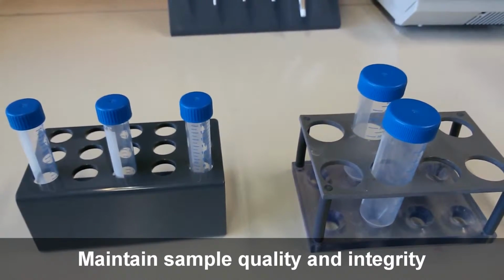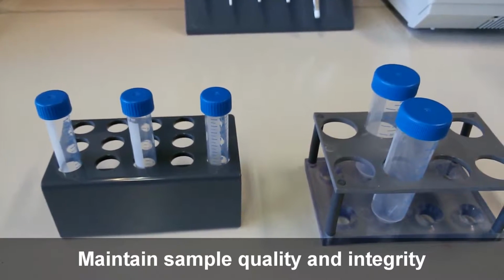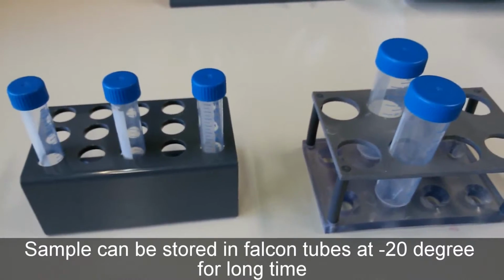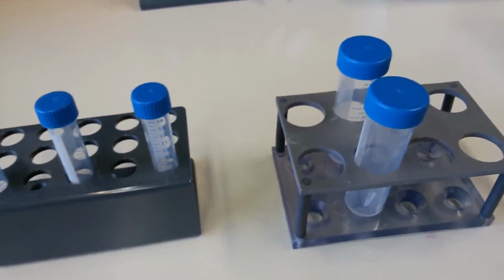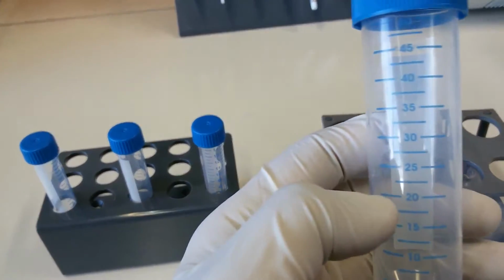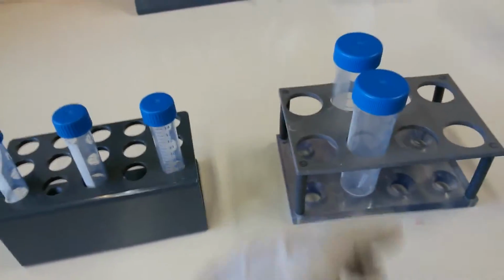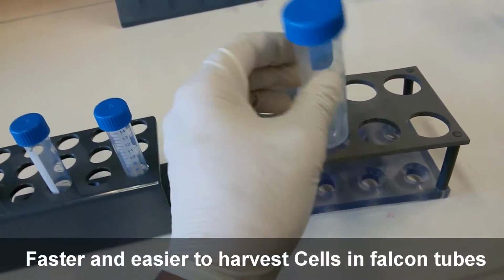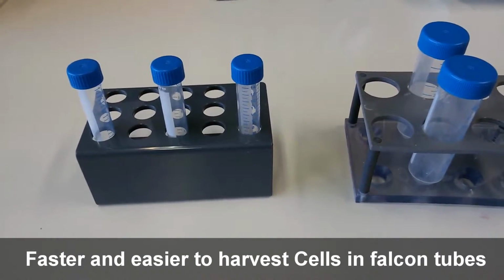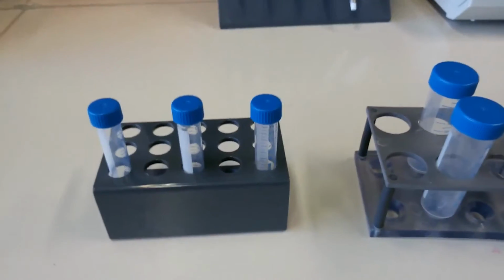We use these tubes for a very important purpose. For example, let's say you want to prepare 20 ml of magnesium chloride solution, you can use these tubes. The good thing about these tubes is that they are also quite accurate. So if you see 20 ml here, that means it's actually 20 ml. Some people use them to do cell culture, and some people use them to prepare a special type of buffer. If you want to prepare anything in a small quantity, you can use those tubes.